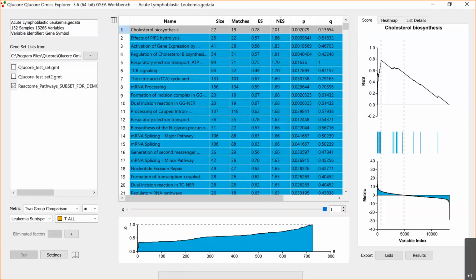We see that we have a positive maximum because we have a number of enriched genes here in the beginning of my data set, meaning that they are upregulated, since this is a t-test. And the maximum value here is the same as this one, the enrichment score. And then we also normalize that, so that's a normalized enrichment score.